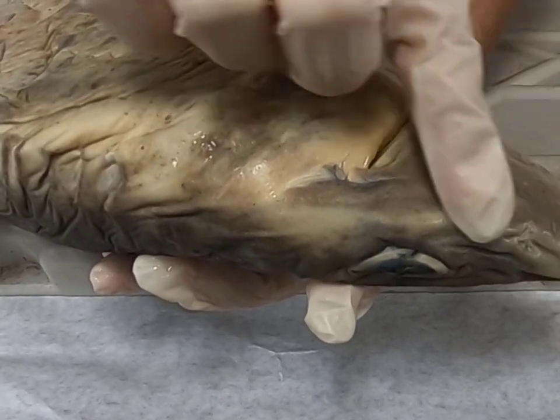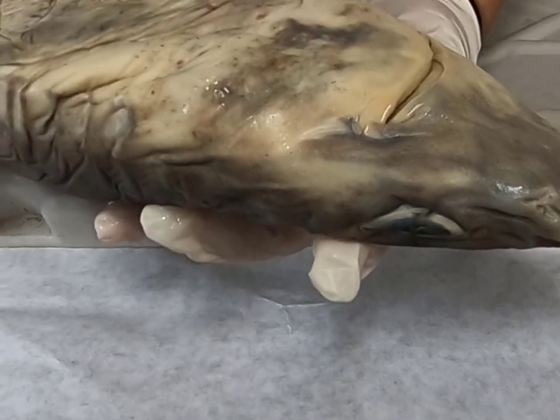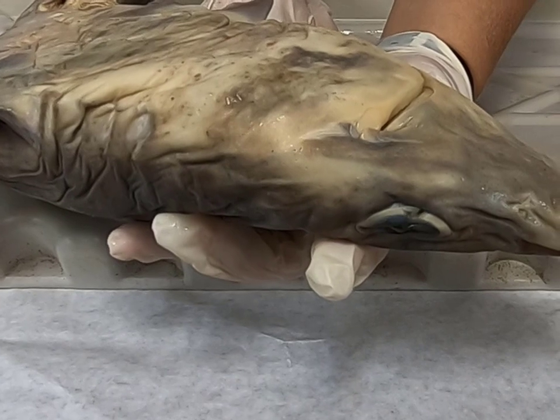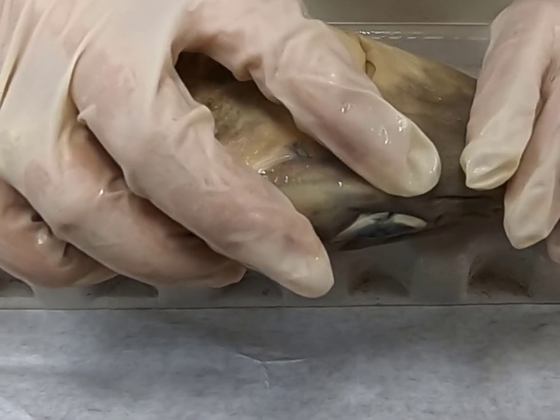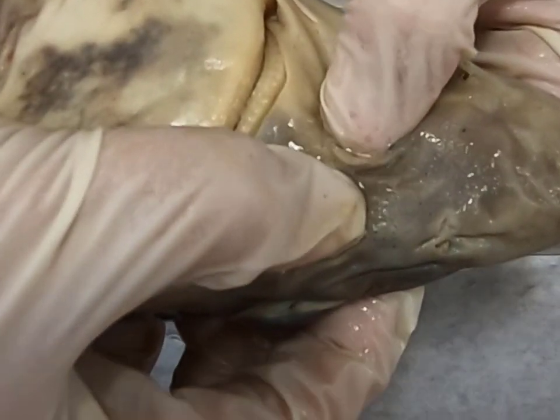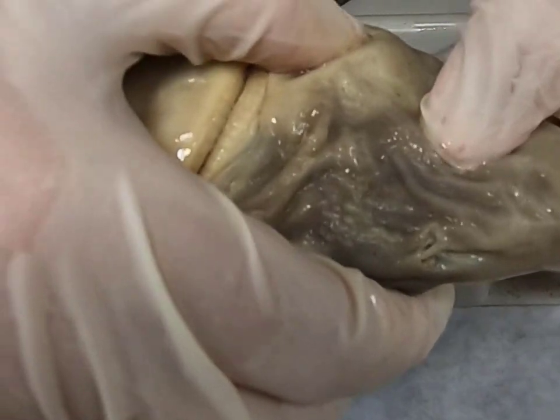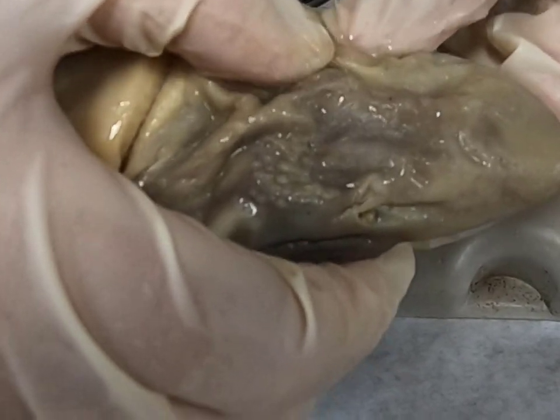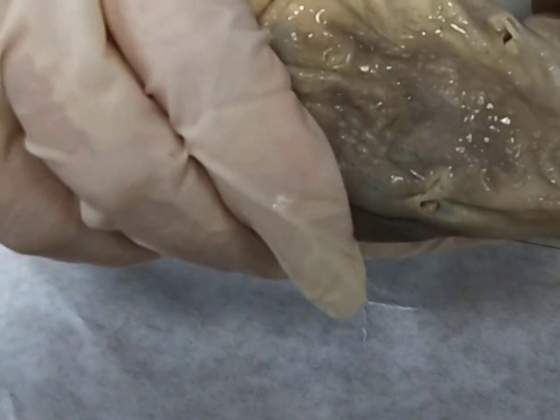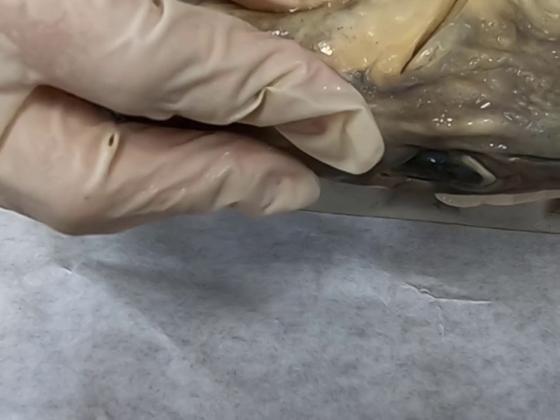But what they're for is, sharks have this sense, a sixth sense, of electroreception. So what that means is they can feel electric pulses in the water. What they have is, if you can kind of see, I'm pinching right here and I'm pinching some gel out of these little pores. So they have all this gel in these pores on their snout. Right there on the snout, yeah. So this gel actually shakes and moves so they can sense that electroreception.